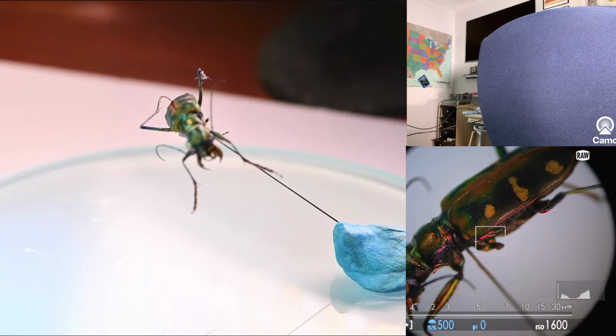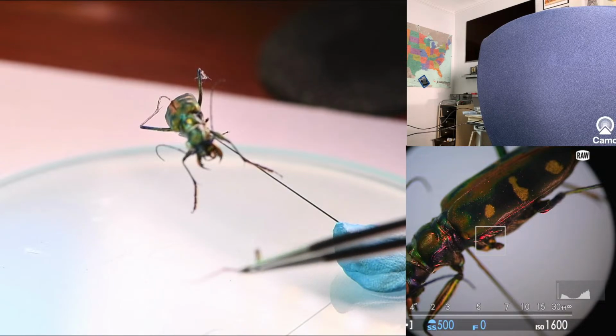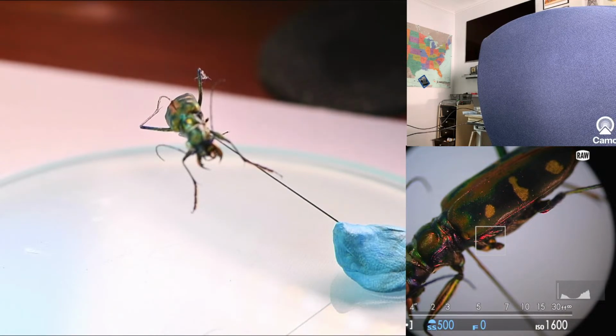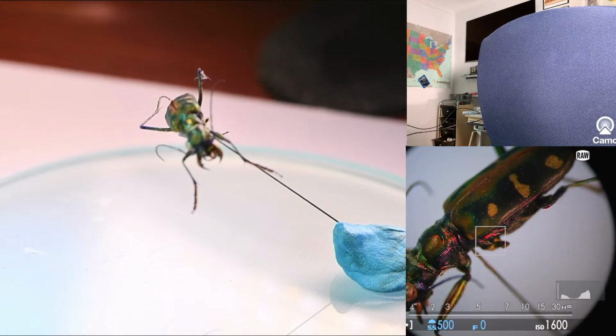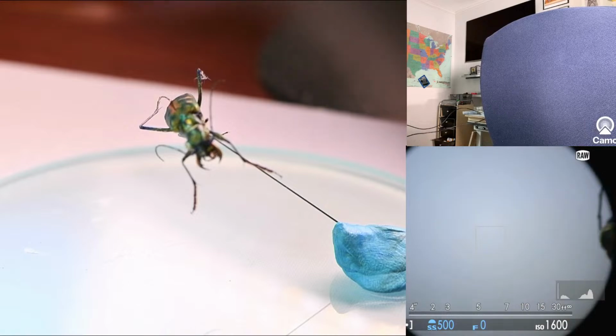Well, the first thing you have to do is find the rest of the appendage, and I was fortunate. I found it stuck to my shirt. Here it is. I think I'm going to swing the microscope across to show it to you. Hang on a sec. Got to loosen up a couple of bolts.